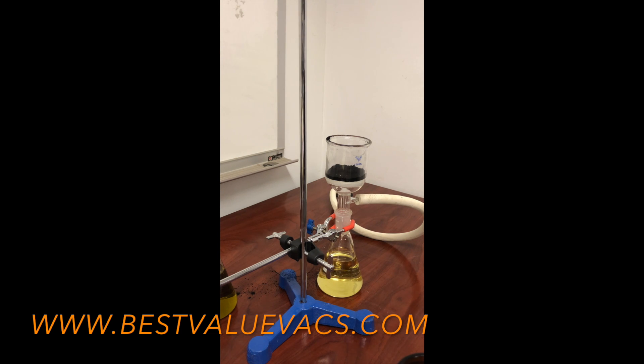I let this run through for a few minutes. I can see it's a lot clearer, but it still has some of that chlorophyll coloring in there. I'm not really happy with the result, so I want to add more carbon to it.